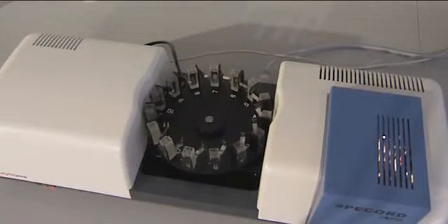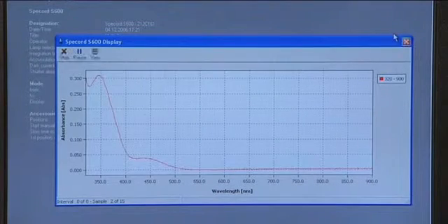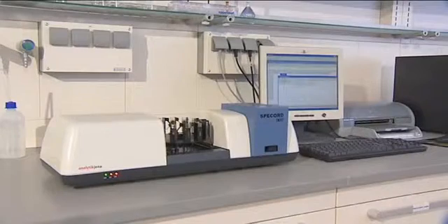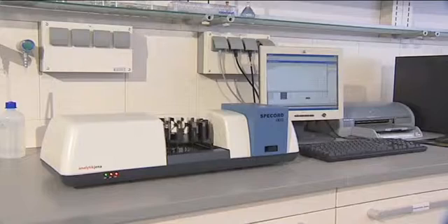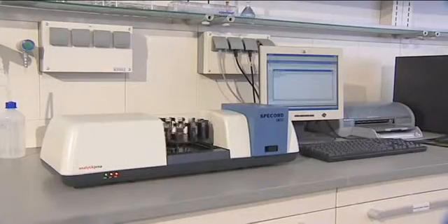You can quantify all substances which either show self-absorption or form a colored complex by chemical reaction. For instance, environmental parameters like iron, lead, phosphate, nitrate, or nitrite. All results are calculated and displayed automatically after measurement.